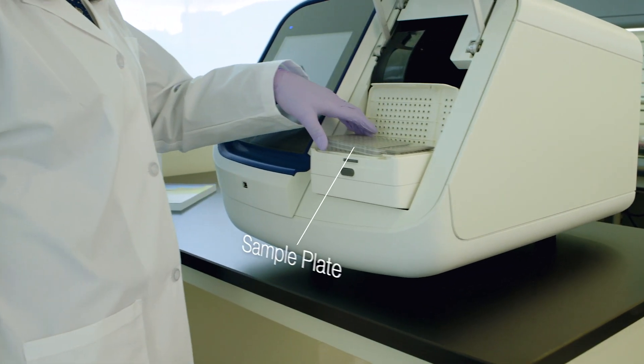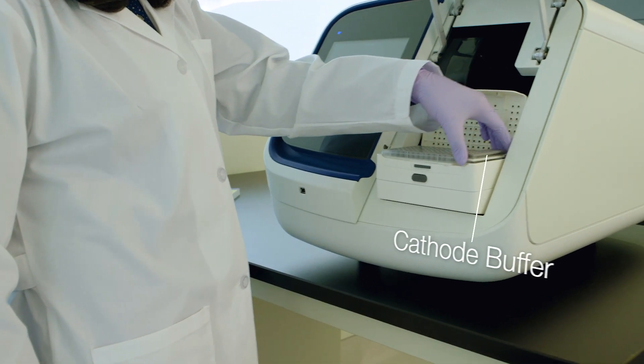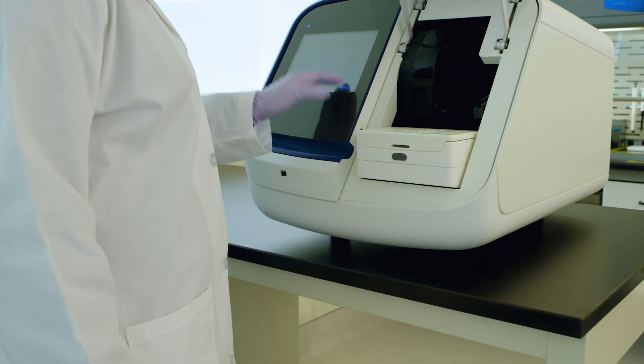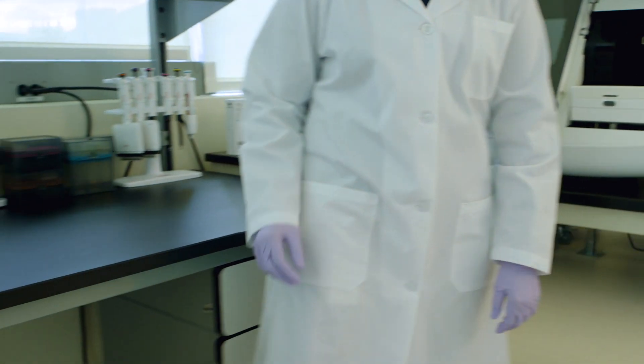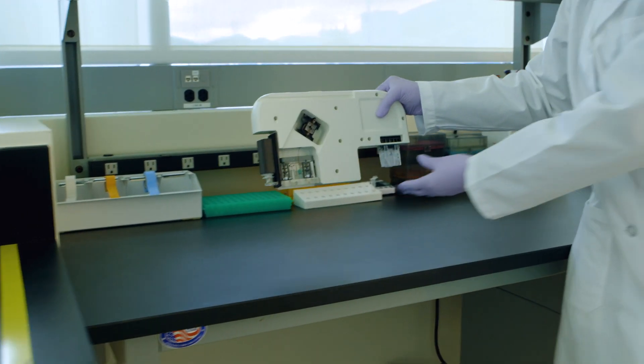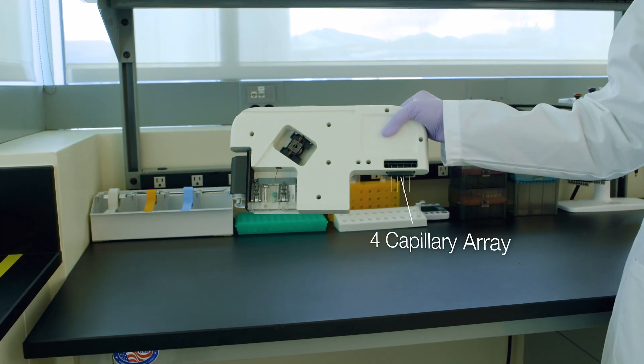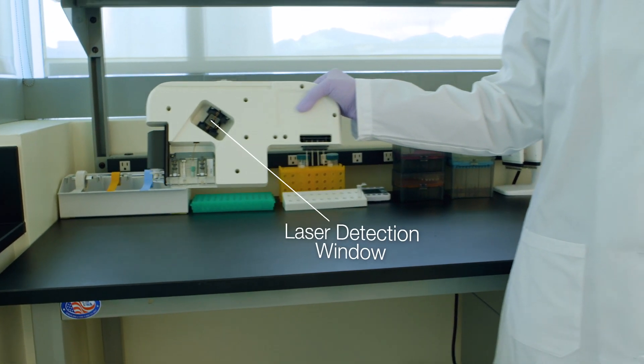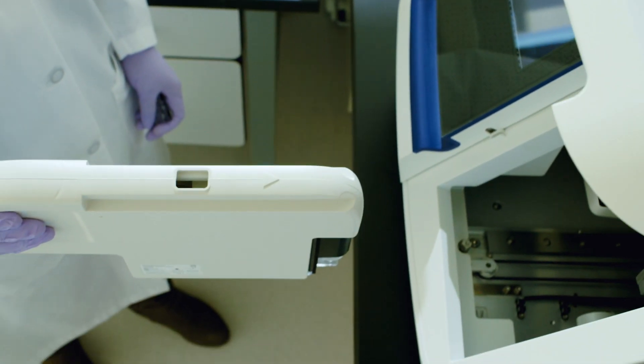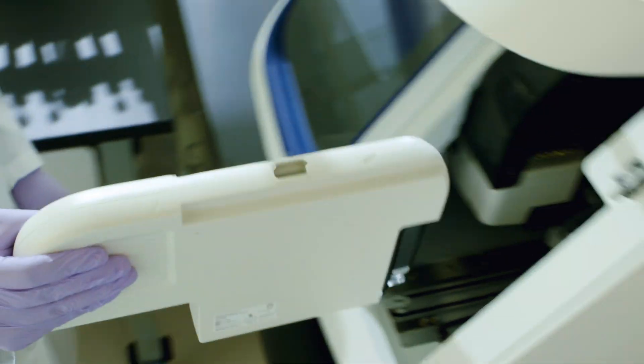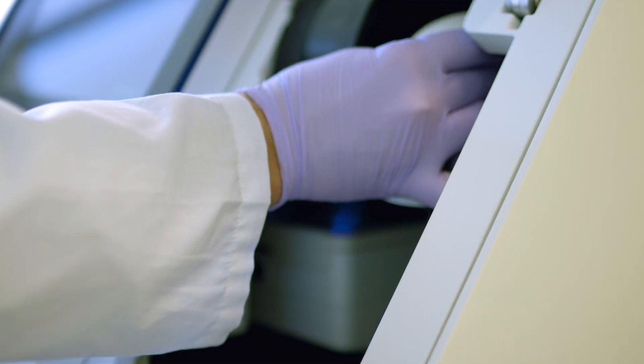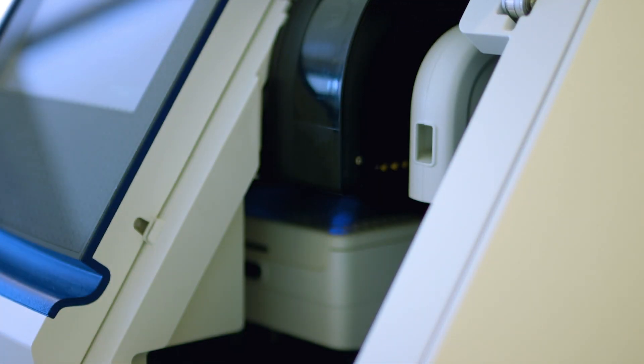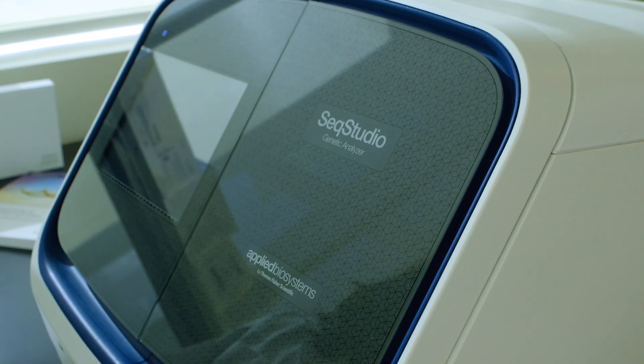Insert the sample plate, cathode buffer, and the cartridge. This includes everything you need: the capillaries, anode buffer, polymer delivery system, pop-one polymer, and the laser detection window. One simple step with no fussy capillaries—it clicks right in.